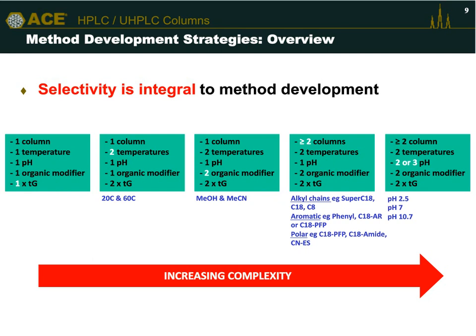Now, in today's talk, I'm going to focus on the power of the stationary phase or the bonded phase type. I want to demonstrate how understanding the different mechanisms of interaction between the bonded phase and the analytes can be very powerful in terms of maximizing resolution via selectivity.